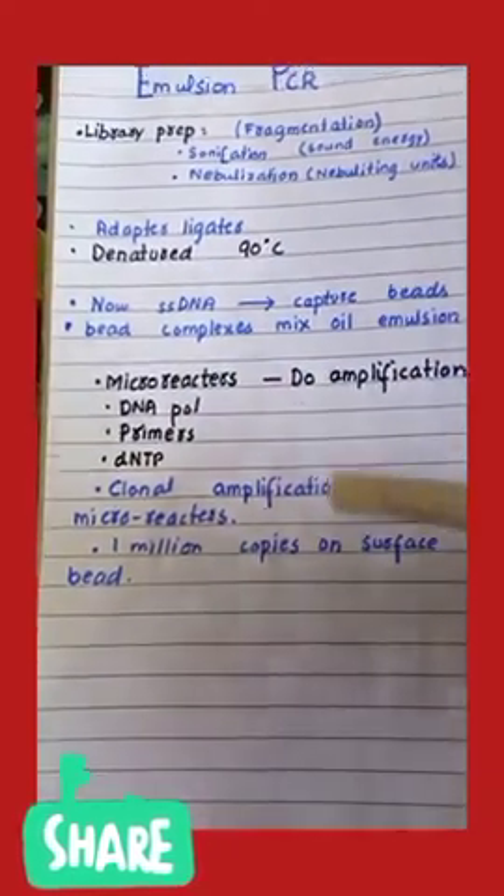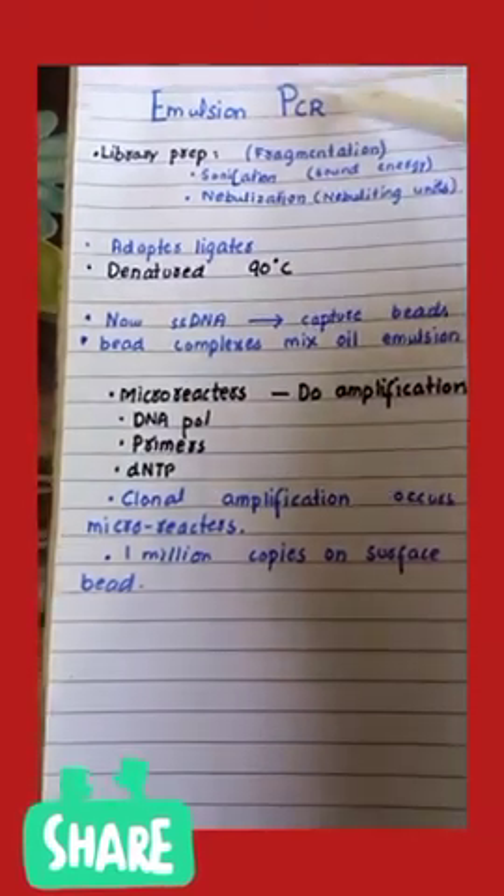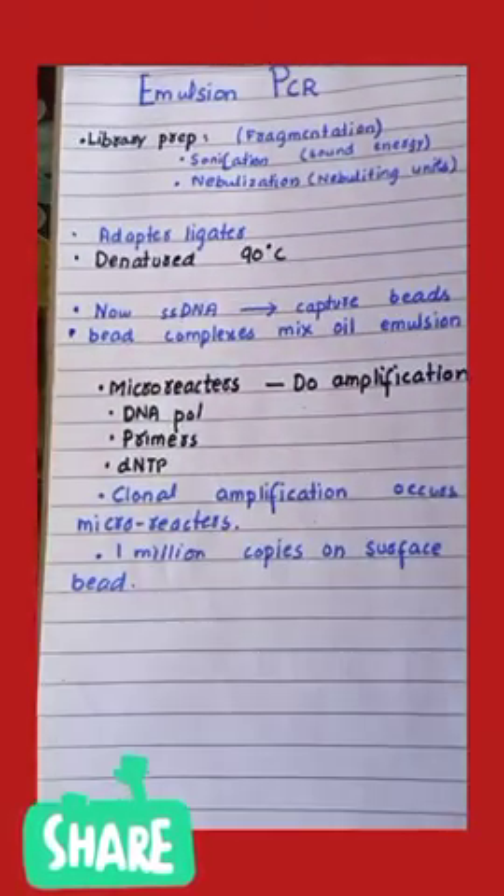After this step, one million copies are attached on the surface of the bead. This is how emulsion PCR works. Thank you so much, bye bye.